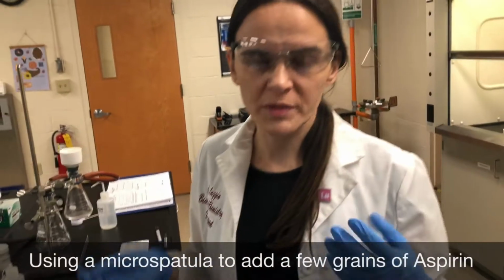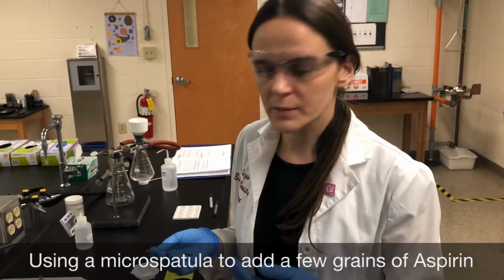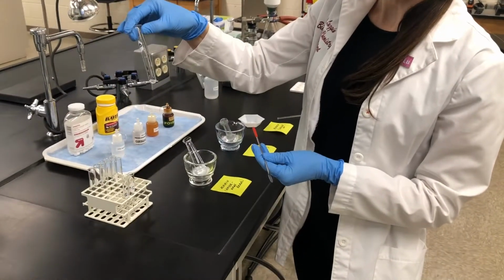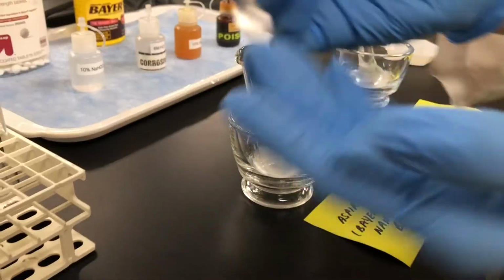This allows me to obtain literally a few grains of the aspirin. I don't want to add a lot for this amount of water, so I'm using about 10 drops of the deionized water.